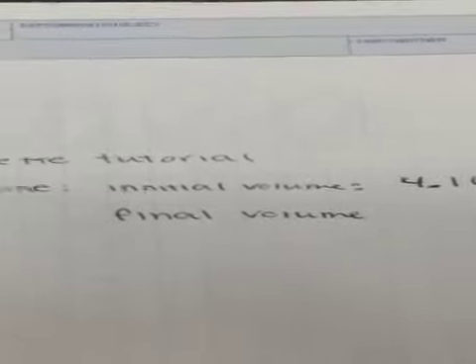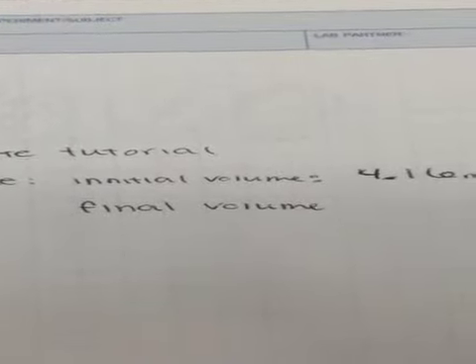So the reading on this one is 4.166. The measurement is 4.16 milliliters.